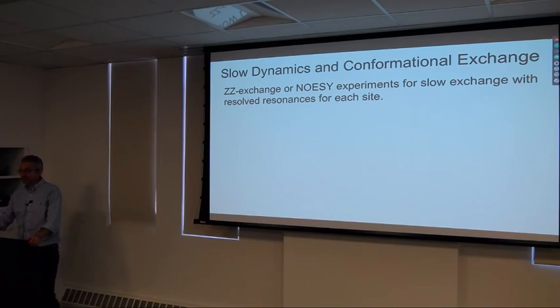For example, if you have a protein that undergoes some large conformational change in 2 states, say from open to closed, then rotational tumbling is going to change, and one might hope to characterize that change from these experiments. And they turn out to be very, very good at this. We talked about this a little bit last time, that one can measure R1 and R2 and use that to extract the diffusion tensor.